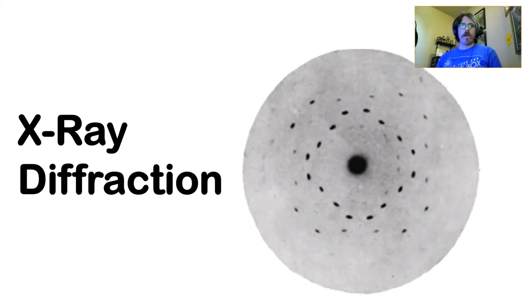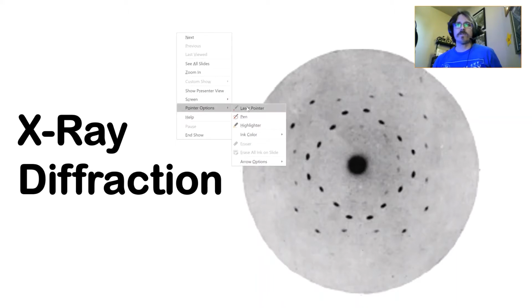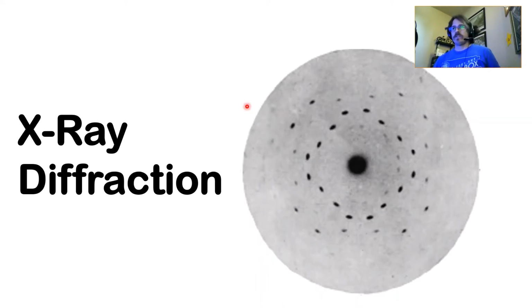We're continuing our lectures on X-ray diffraction, and what I have here is an early diffraction pattern. For the most part, with the exception of single crystal diffraction, diffractometers give you a spectra, so you have to figure things out from looking at a line on a screen.